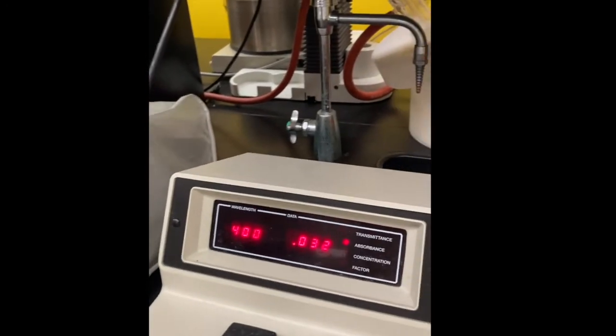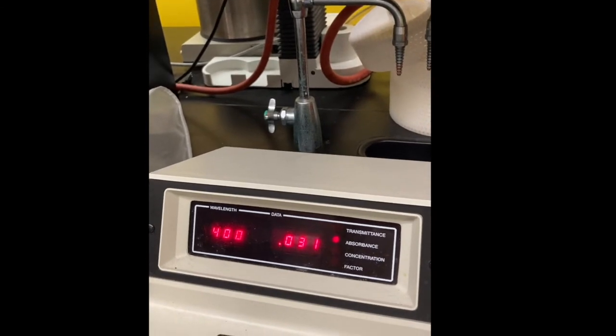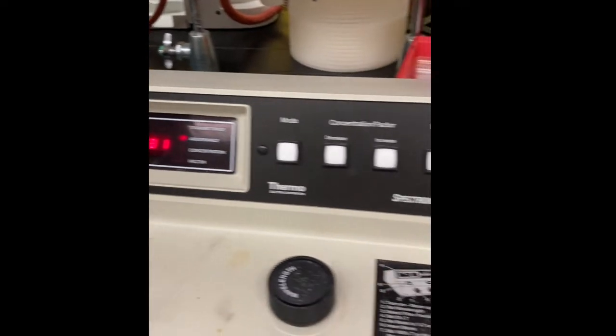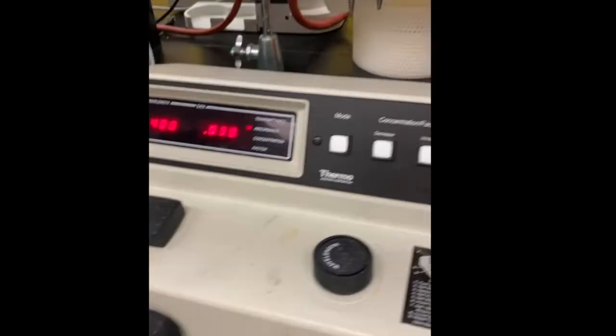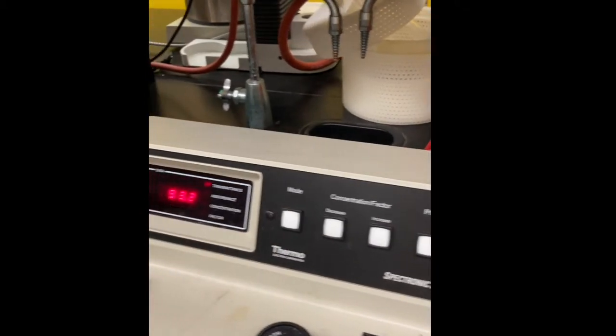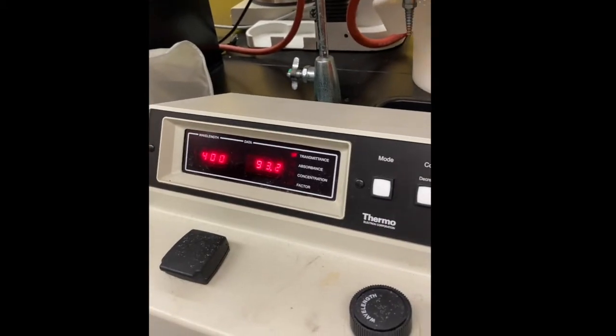Of course, before we start our measurements, we need to set up the spectrometer, and this is done initially in transmittance mode.